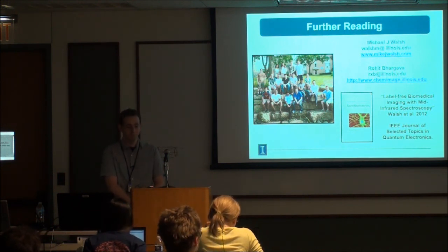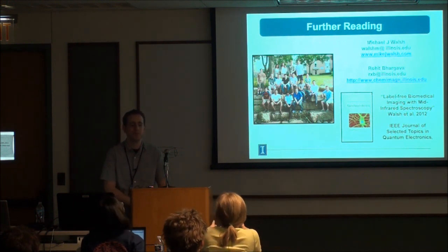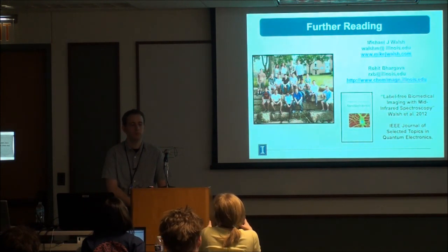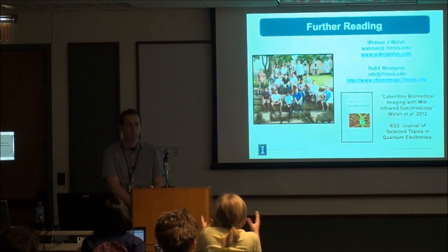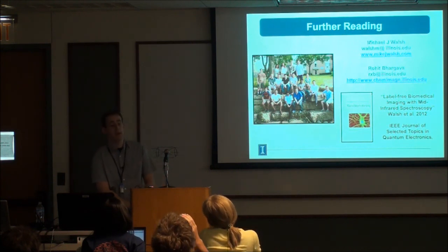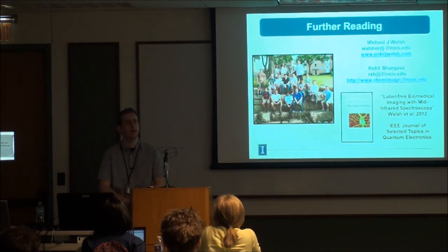One more question. So when you set up, the sample is exposed to airflow, why don't you use some kind of enclosure? Yeah, so actually the machines themselves are purged. In fact, most of our machines are purged with dry nitrogen.